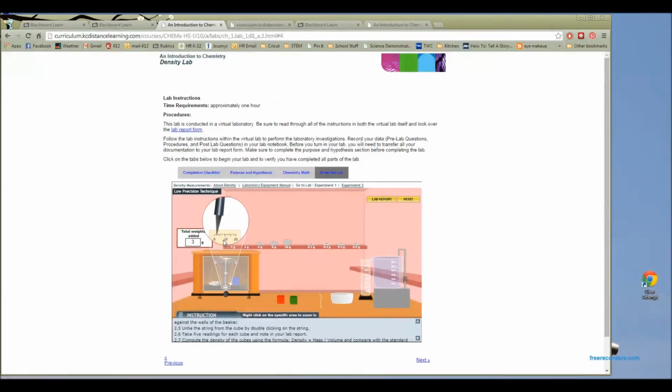Well, I want my needle to be centered on the 10. It is way off the 10, and that tells me that this side right here is too light. So I need to add a lot more weight to this side to get the actual value, the actual mass of this blue cube. So there are little pop-up instructions.